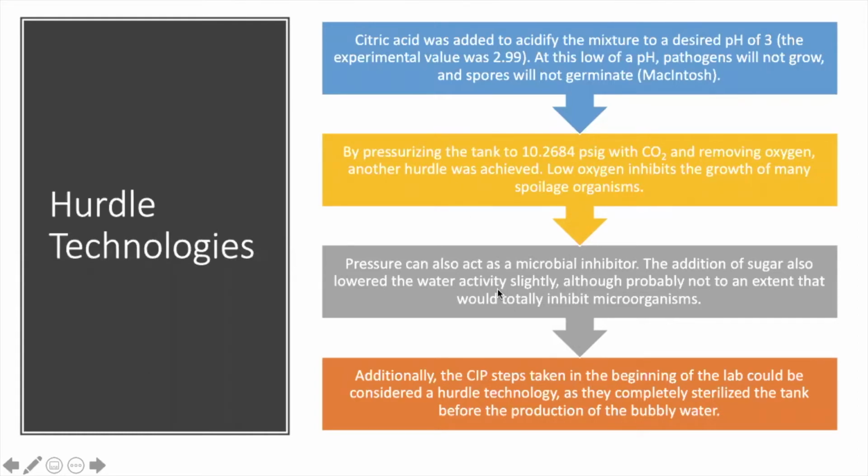Additionally, the clean-in-place steps taken in the beginning of the lab could be considered a hurdle technology as well, as they completely sterilized the tank before the production of our Gator Bubbly began.